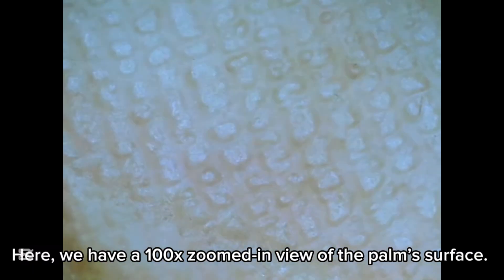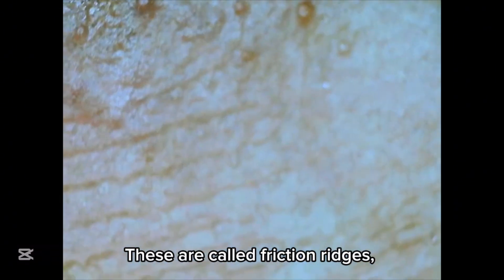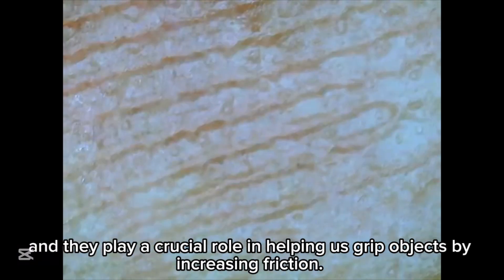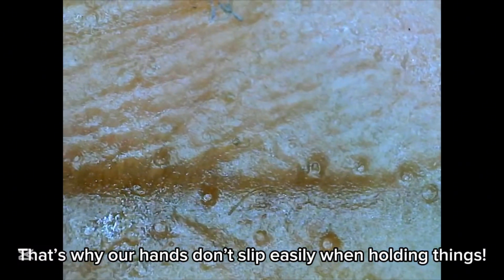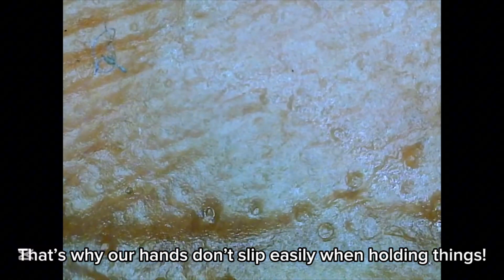Here, we have a 100x zoomed-in view of the palm's surface. Notice the rough, interwoven lines. These are called friction ridges, and they play a crucial role in helping us grip objects by increasing friction. That's why our hands don't slip easily when holding things.